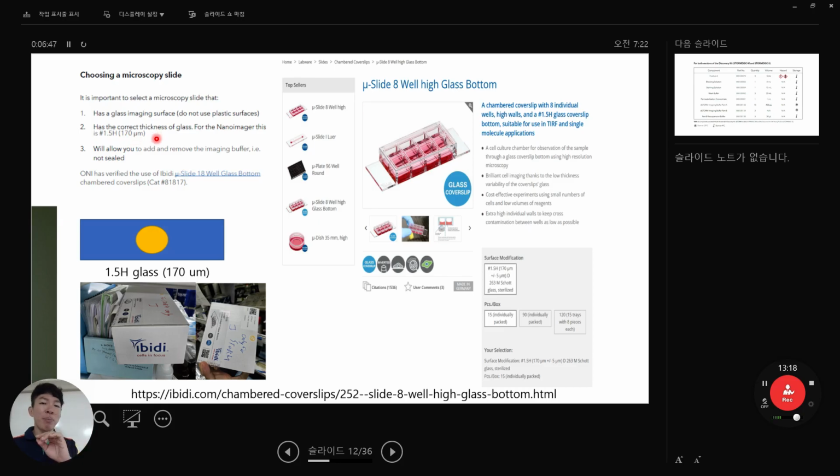So we already bought special glass, a micro slide eight-well, because it has a thickness of 170 micrometers. We have to culture the cells on this, then you can stain and do imaging. But what happens if we use another glass thicker than this, like 200 micrometers? With STORM imaging, the working distance is not that long, so you cannot visualize properly.